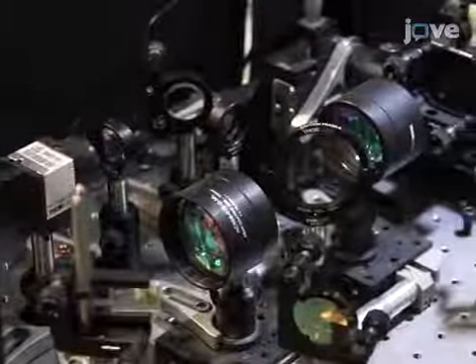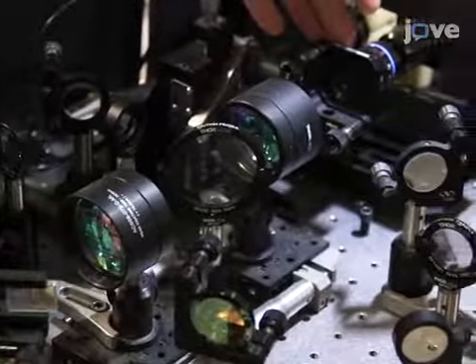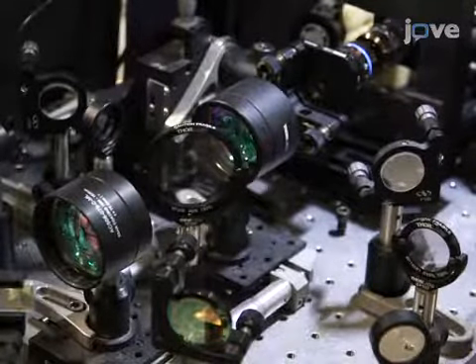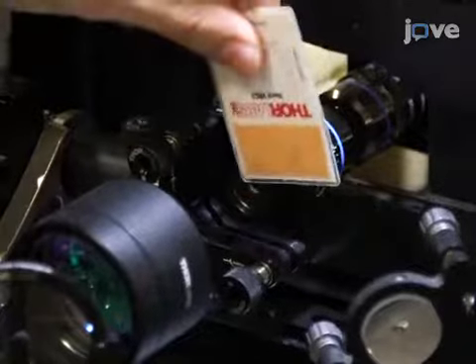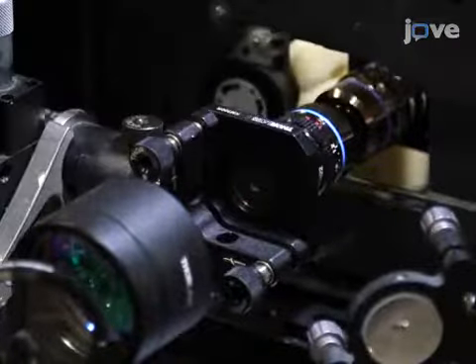Configure a telescopic relay lens assembly in a 4F imaging system to direct the spectral shower onto the rear focal plane of an objective lens below a sample platform. Ensure that the spectral shower fills the rear aperture of the objective lens.